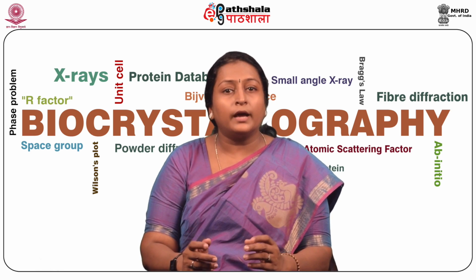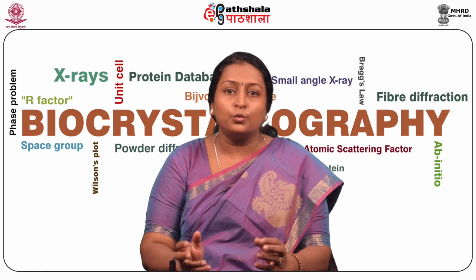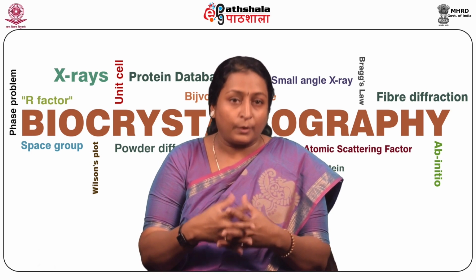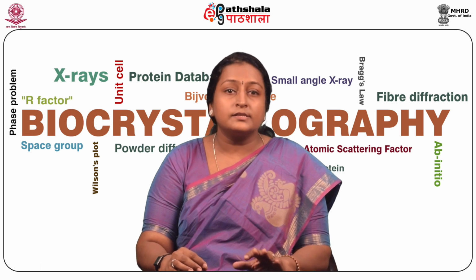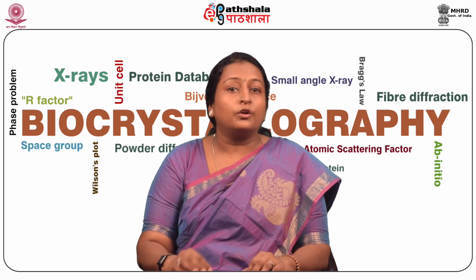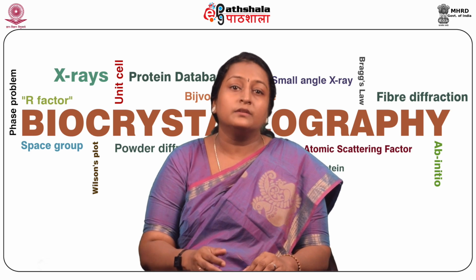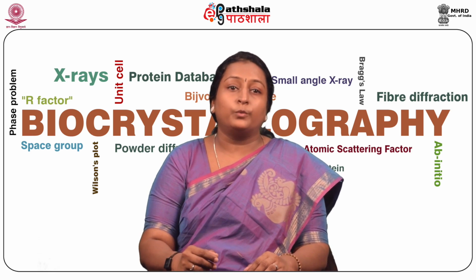However, it is perhaps in the past few decades that we have seen some of the most remarkable breakthroughs in experimental powder diffraction and in the analysis of powder diffraction data. Instrumentation has become increasingly versatile, to the extent that high throughput and high resolution are no longer mutually exclusive. In the field of data analysis, sophisticated algorithms help in characterizing, solving, and also refining the structure of molecules.